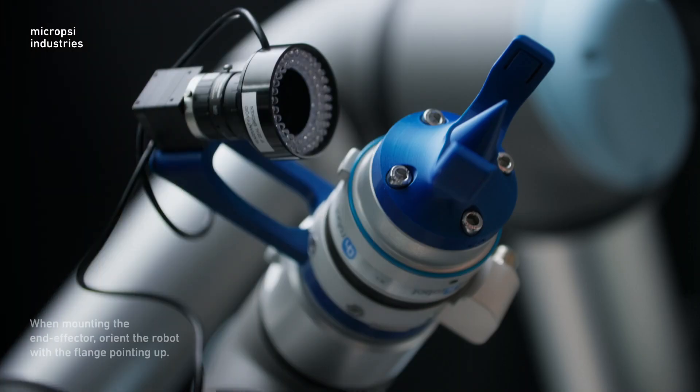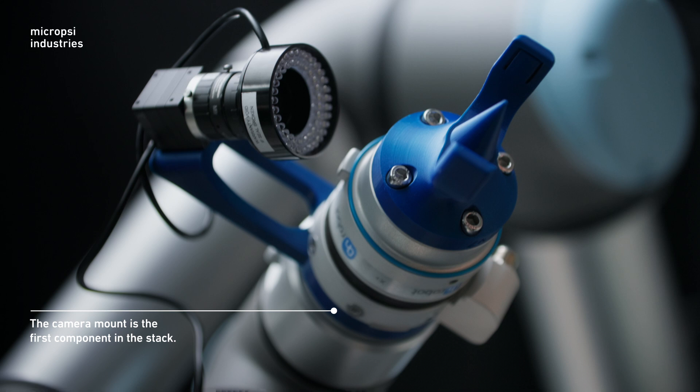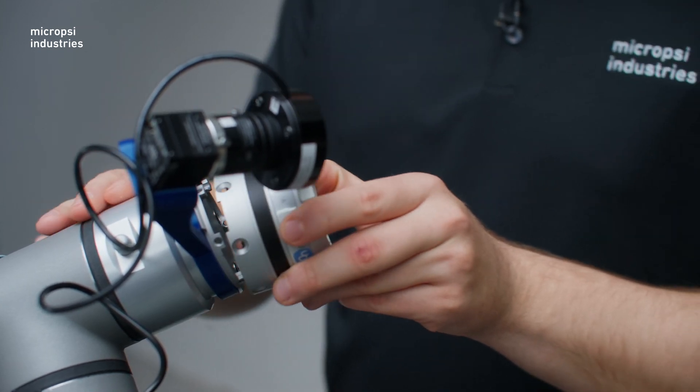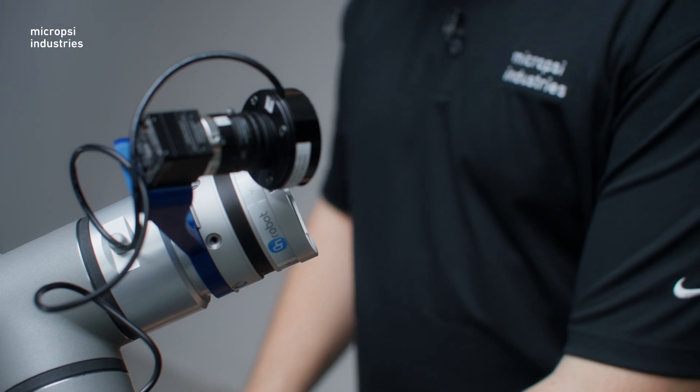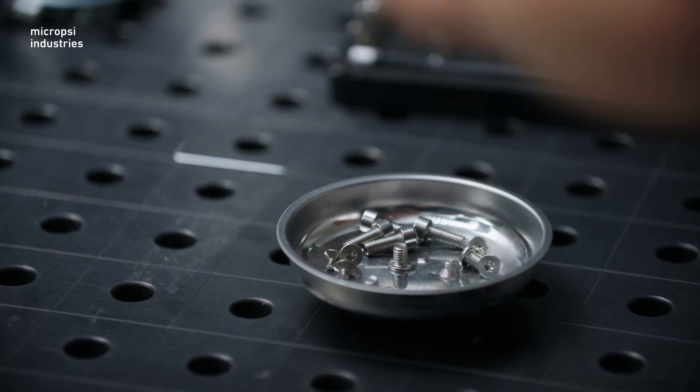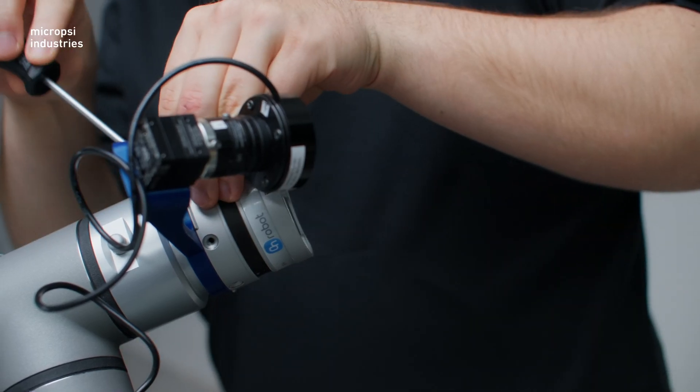It's good practice to orient the robot with the flange pointing up when mounting the end effector. Also, take note that for most use cases, no matter what end effector you use, the camera mount is the first thing that goes on the stack. Now it's time to install the force torque sensor. The sensor fits naturally on the base plate and is secured with the supplied screws.